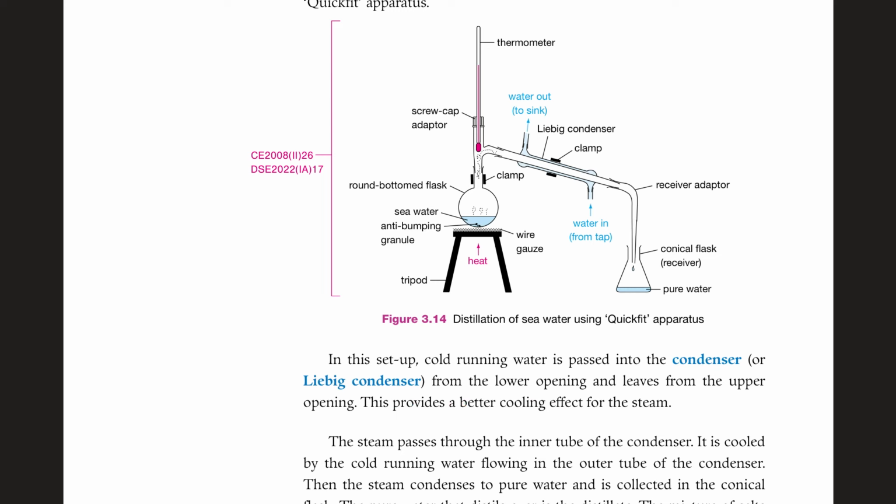By filling the condenser from the lower opening, the condenser can be completely filled by water. However, if we fill up the water from the upper opening, the running water would leave the condenser very quickly without filling up the whole condenser.